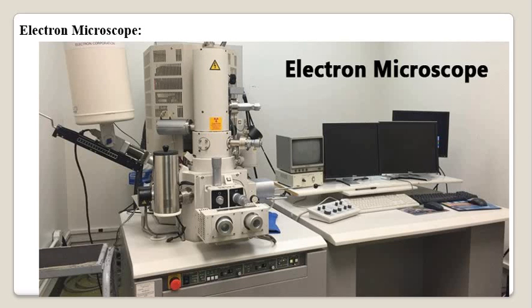So electromagnetic lenses or coils, as we said earlier, in case of the electron microscope, are used as a magnifying system, part of a magnifying system. So the coil corresponds to the condenser and objective as well as the ocular lenses of the light microscope, which is built inside this column.